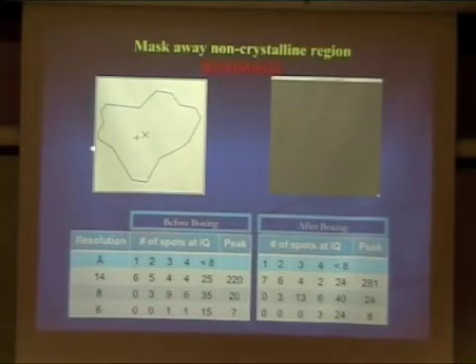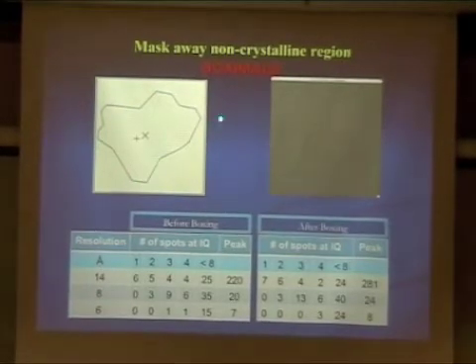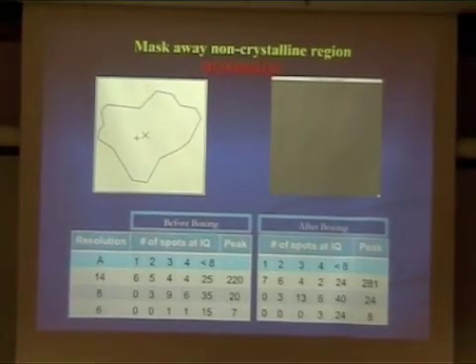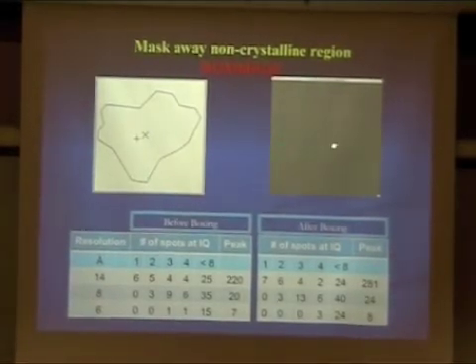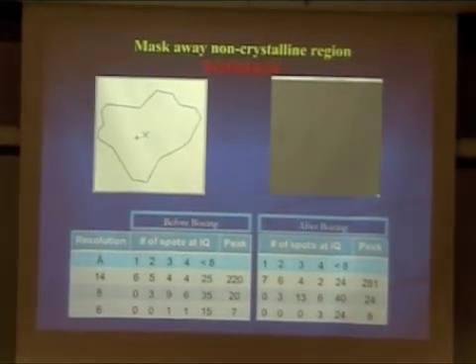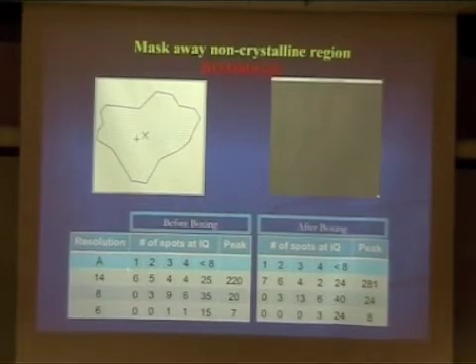So this is what I would do with the image we still have there. I would pick, for example, a 50% cross correlation, using a 50% cross correlation to create a polygon in here, and use the box image program that will create, from the original, something that looks like this. You can't tell the differences, but once you Fourier transform that and create your list of amplitudes and phases, this is what you will get.